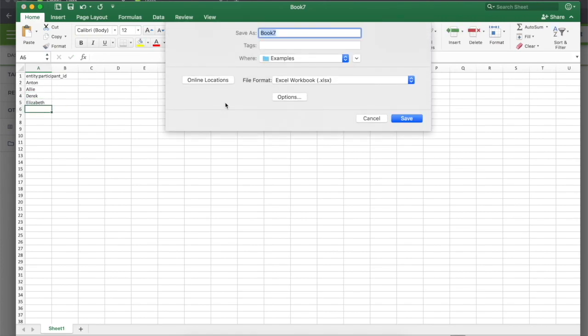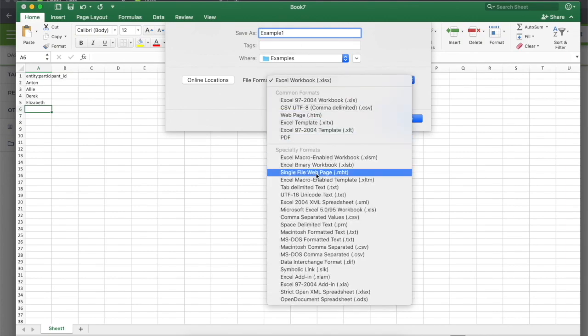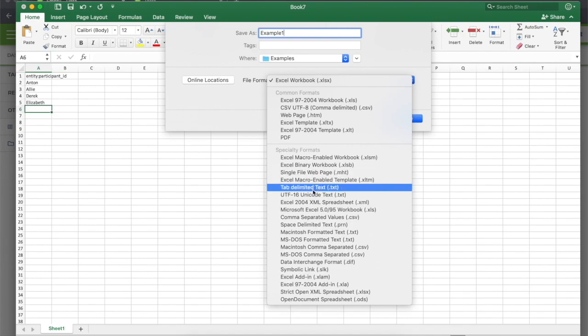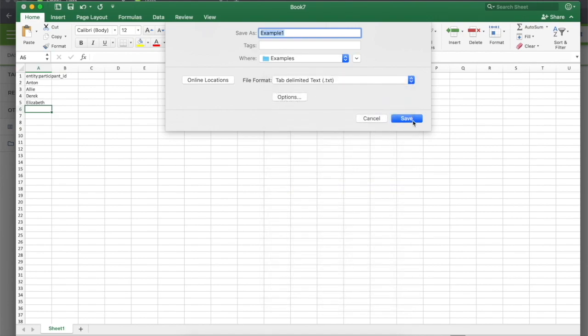Just make sure your top left cell matches the one shown here exactly. Then save in the proper format, and if necessary, rename the file to have the .tsv extension.